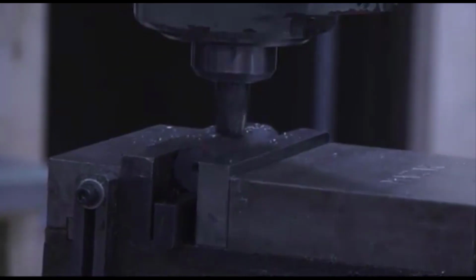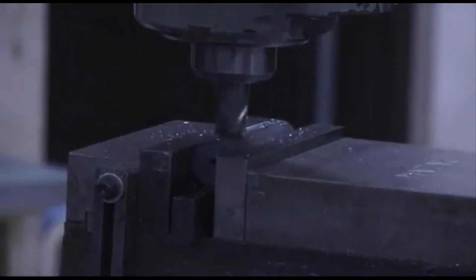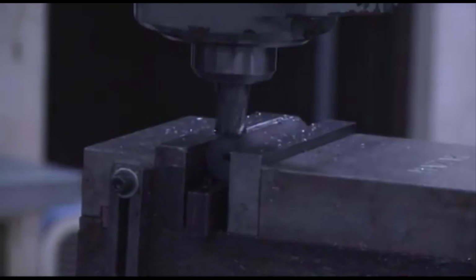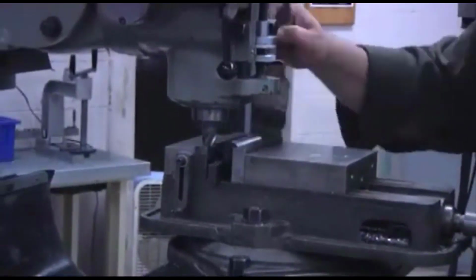Again, the ASTM standard calls for the surface here to be ground rather than milled, but since we don't have a convenient setup in our machine shop to do that, we make use of the end mill and we just do our best to get a nice clean surface.